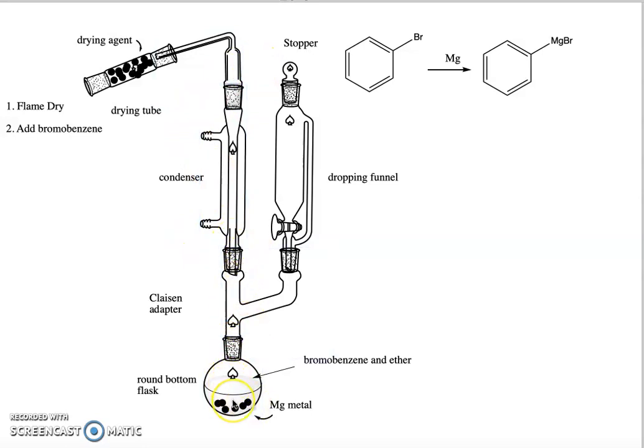Remember, you have condensing water going through the condenser in the bottom and out the top. We're going to be refluxing this and it's going to be generating its own heat because the reaction is exothermic. It should, if everything's dry, start all by itself almost immediately.